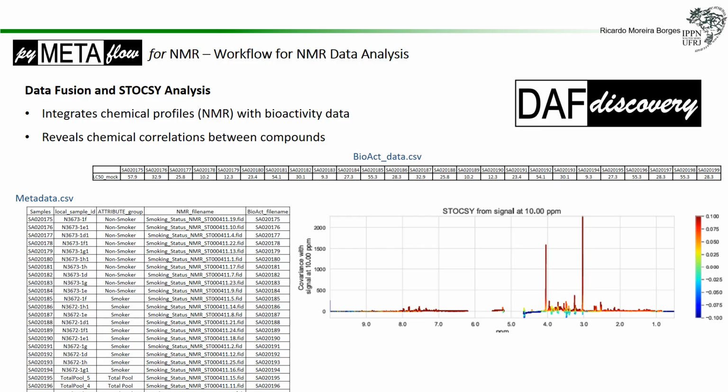And you can actually add another spectroscopy technique from that. You can add LCMS features into your analysis and calculate the correlations from your LCMS data to your NMR data to improve your identification routine or confidence, right?